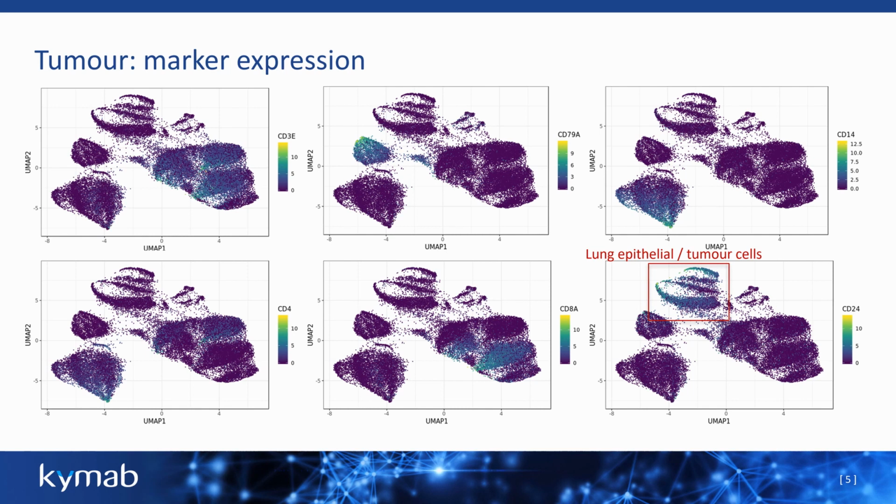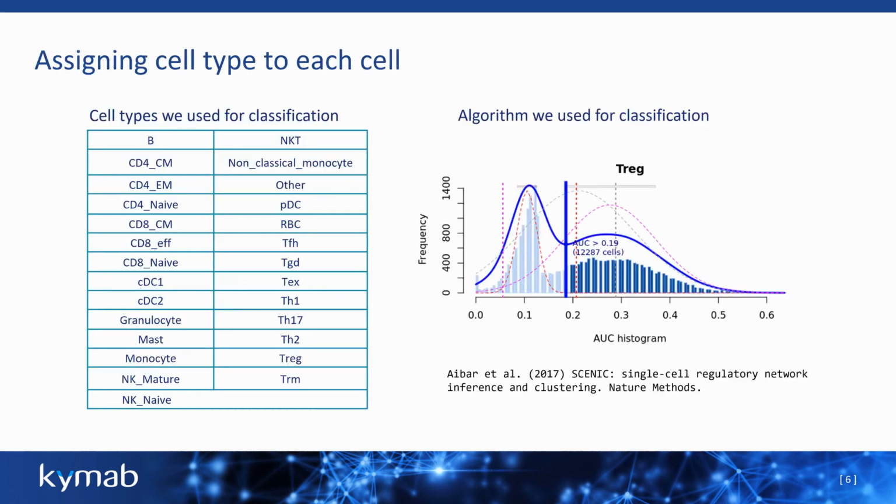But obviously, using the BD Rhapsody, we're not just measuring these 6 markers. We're actually measuring 366 markers. So there's a lot more information that we can get from these samples. I've looked at various different computational approaches to get as much information out as possible, and we had a conversation at lunchtime about this. So like Ricardo said at the beginning, you can see the structure in the data, but it's actually quite difficult to find discrete clusters of cells.